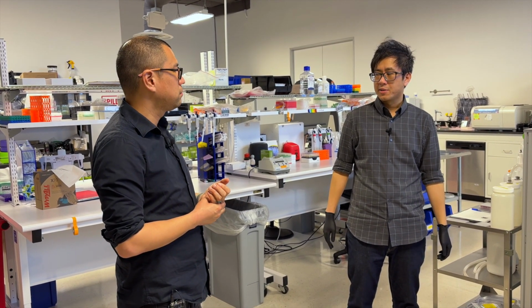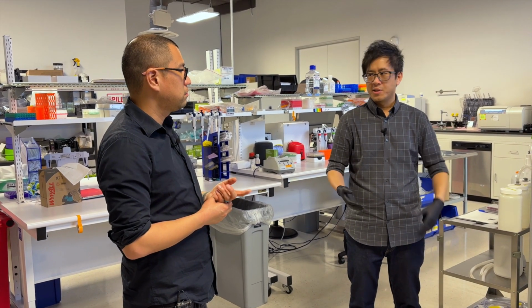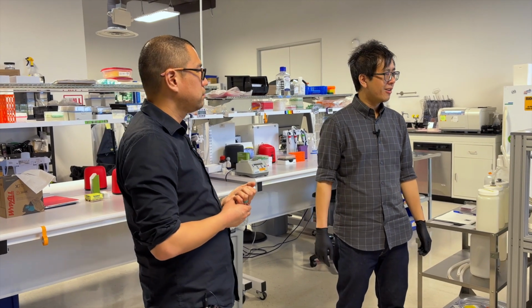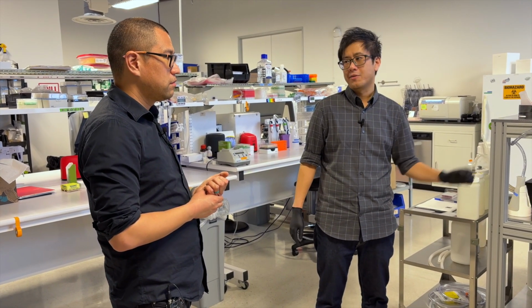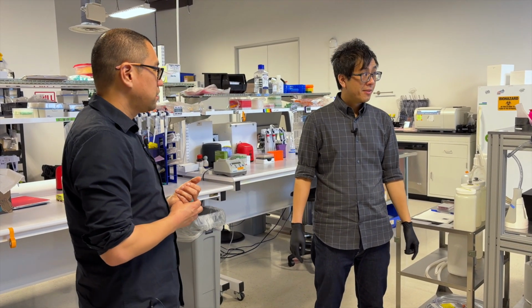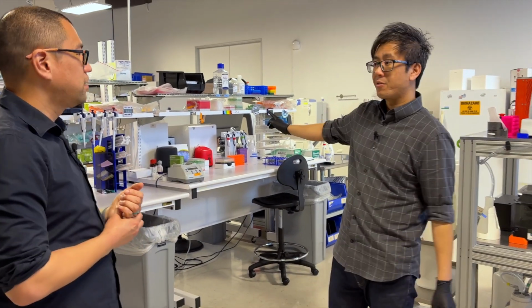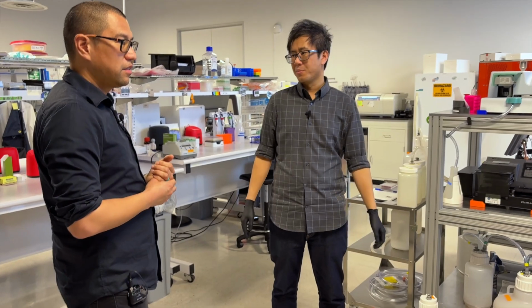When you prepare cells for flow, you want to block, you want to stain, do some various wash steps, and you load into your flow cytometer. You basically just want to replicate all of those steps, but in a 384-well format through robotics. And that's basically what we've done here. Very cool. So you do staining on here as well? That is an example of semi-automation. And so we will actually use some of our other robots to do staining. Got it. And then have people move them to a different portion of our lab.